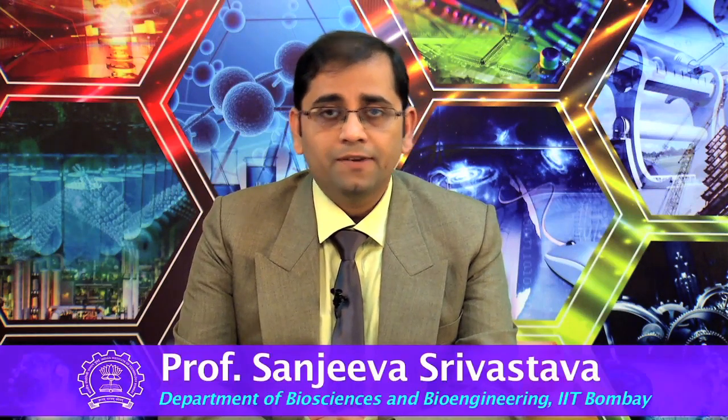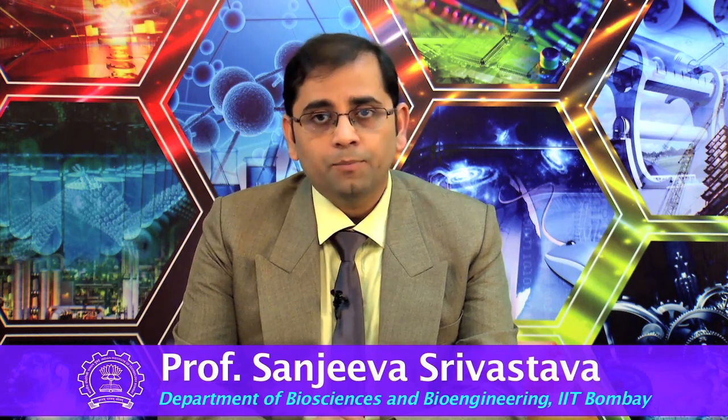This is Dr. D.R. Mani's second lecture. In the first lecture, he had discussed various strategies employed for data normalization. In today's lecture, we are going to continue the discussion about data analysis, especially batch correction and missing value imputation. These two things are very important for any type of omic data analysis.